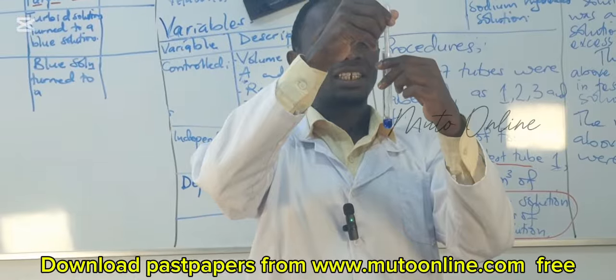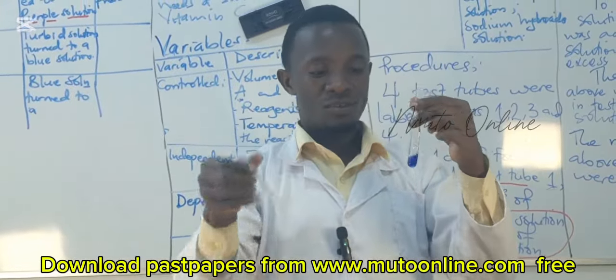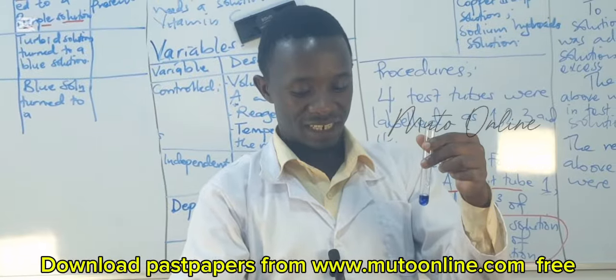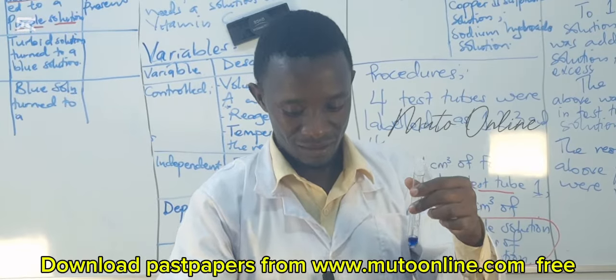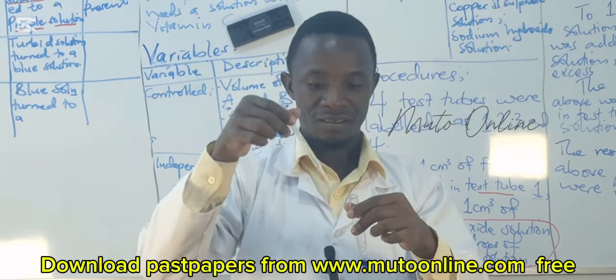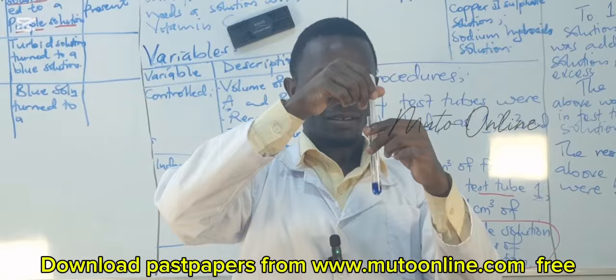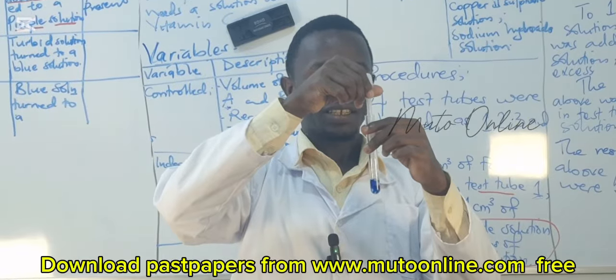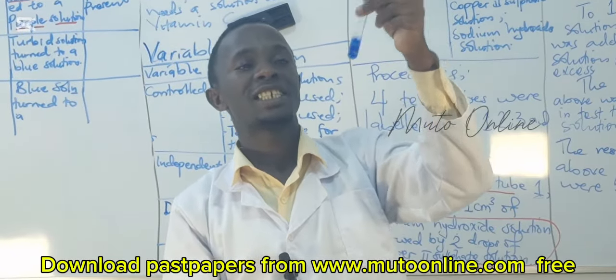So we are adding drops of A. We've added a lot of it until in excess.